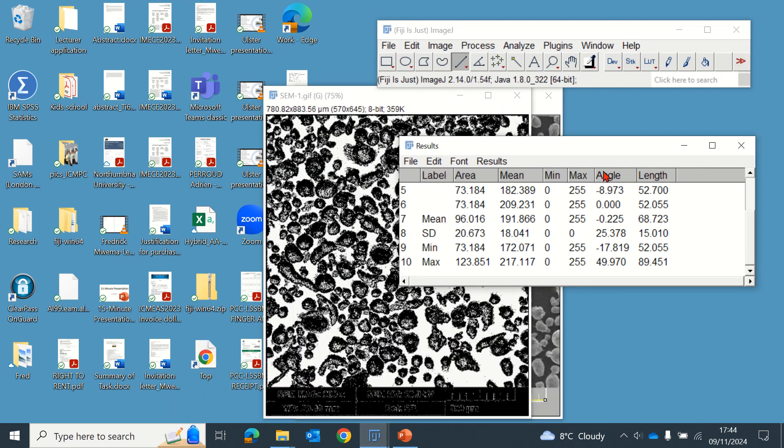So that's what you can do with the image when measuring particle sizes in an image.